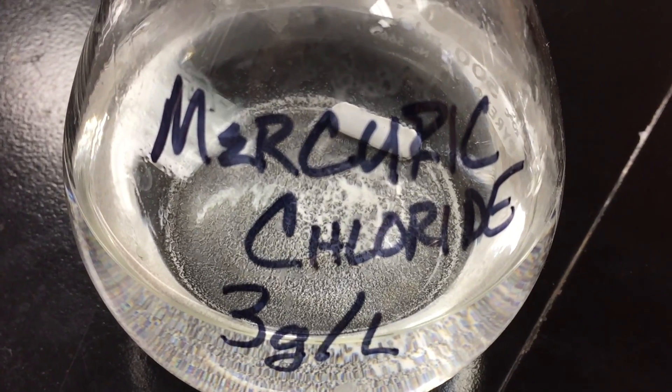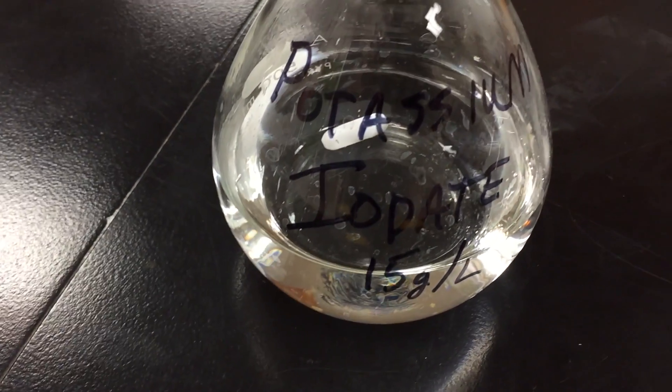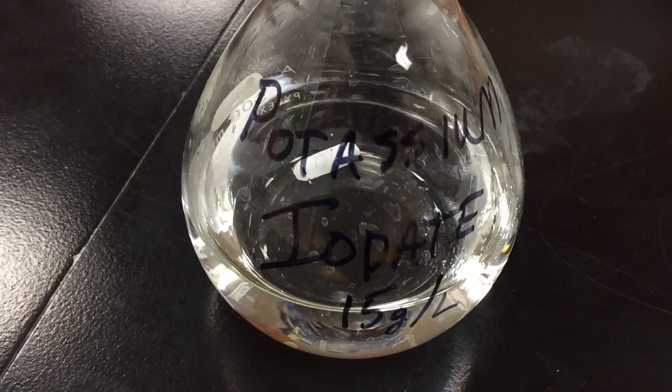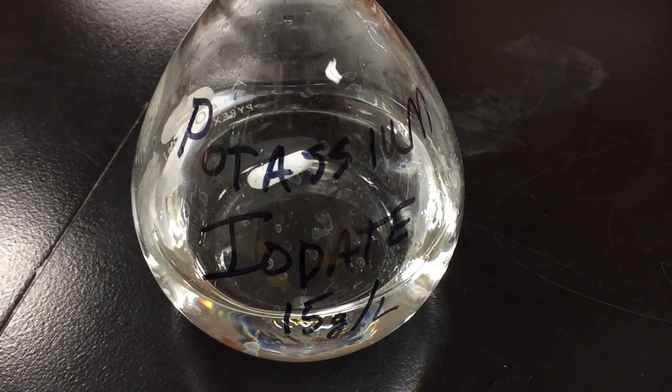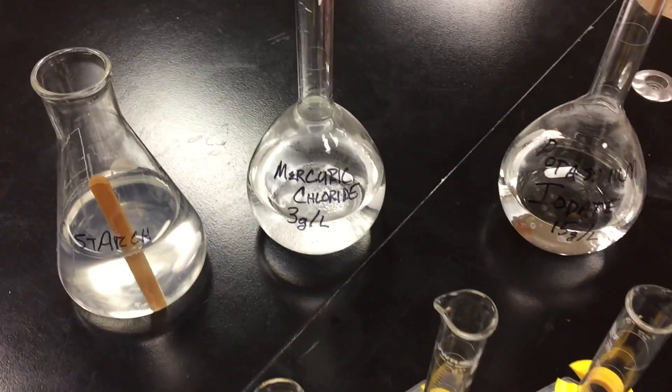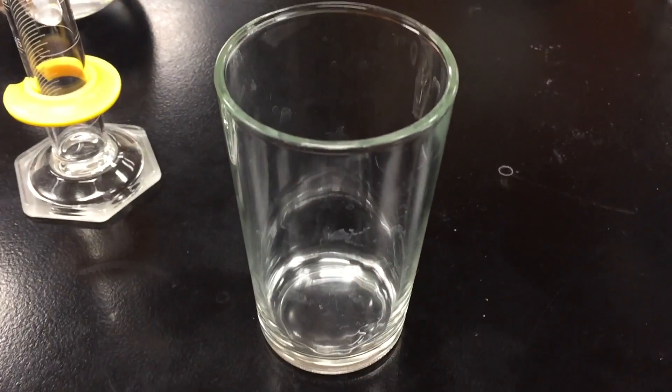And then finally we've got some potassium iodate. The potassium iodate worked out to be about 15 grams per liter. I put about seven and a half grams into a 500 milliliter flask and diluted it with water. All three of these solutions diluted with water. And then I've got some graduated cylinders here just to measure some stuff, and finally our wonderful little glass.